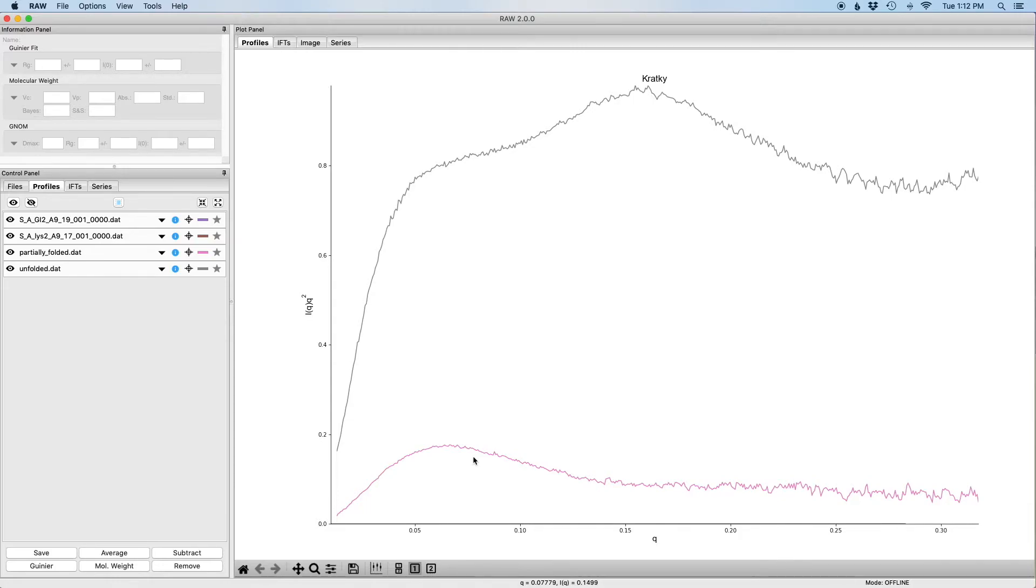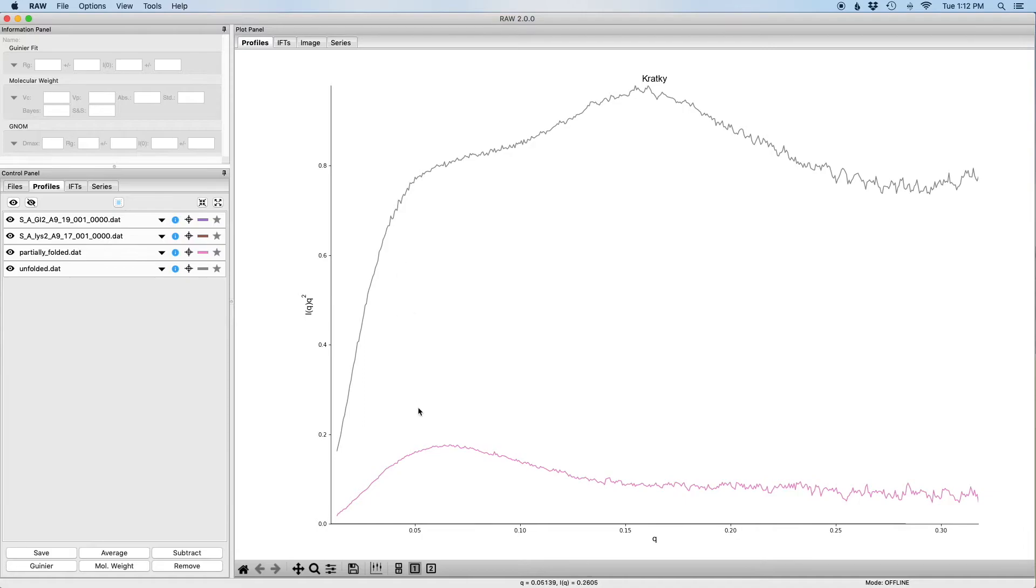The reason for this is that SAX data can be presented on an arbitrary scale, so the intensity values for these two profiles are much larger than the intensity values for the glucose isomerase and the lysozyme data. They've just been scaled up arbitrarily.